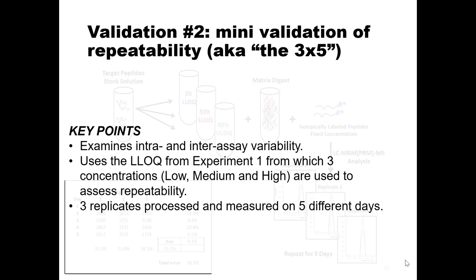If you have any questions on this, now would be good. Well, can you use heavy peptide? Yeah, so this is kind of saying if you did this with peak area ratios. I've done this with label-free without any standards, and it worked just as well.